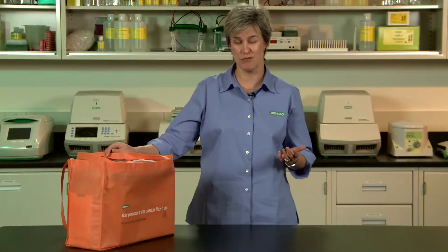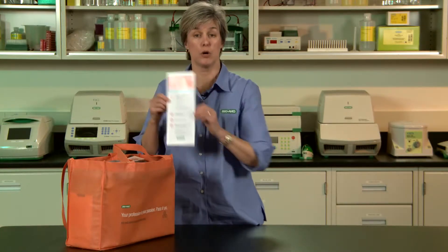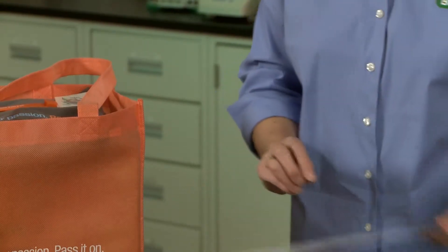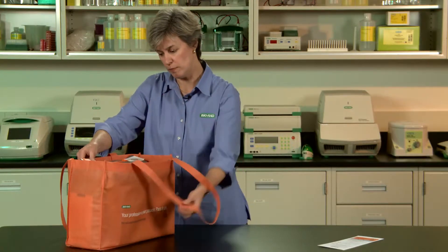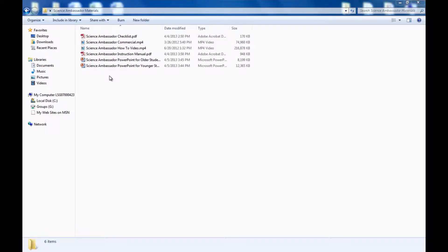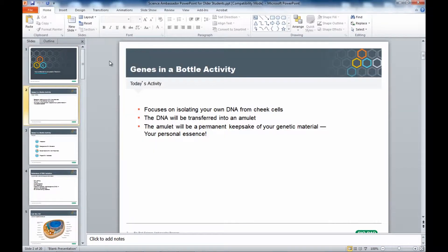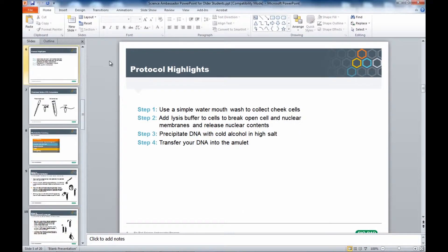So step one, watch the video. The next step is to take a look at the components in your kit. You've got your Quick Start Guide, which you've already found. The next thing we have for you is a great little thumb drive, and there's some nice electronic resources on this thumb drive. You've got the PowerPoint presentation you can use with the students, the video montage of other students doing this, and the video you saw when you actually signed up for the program.